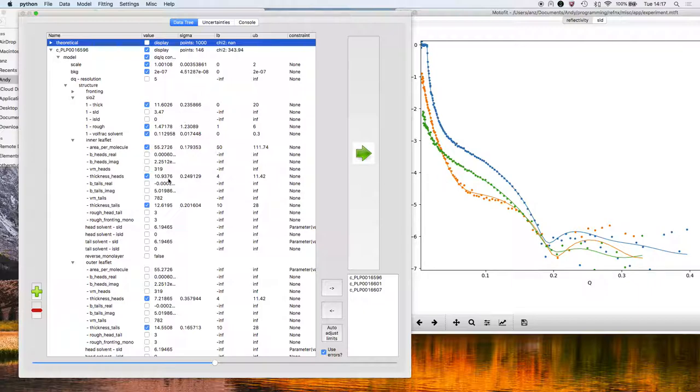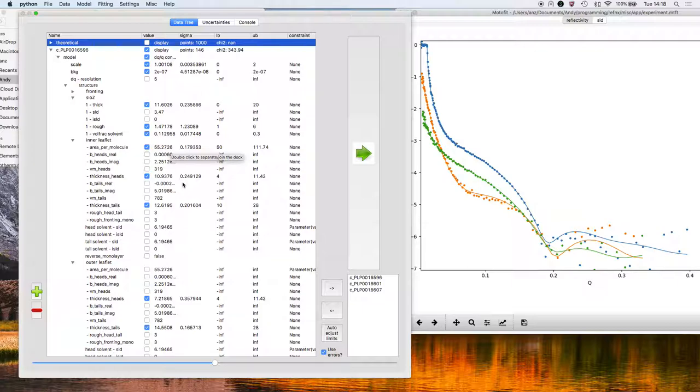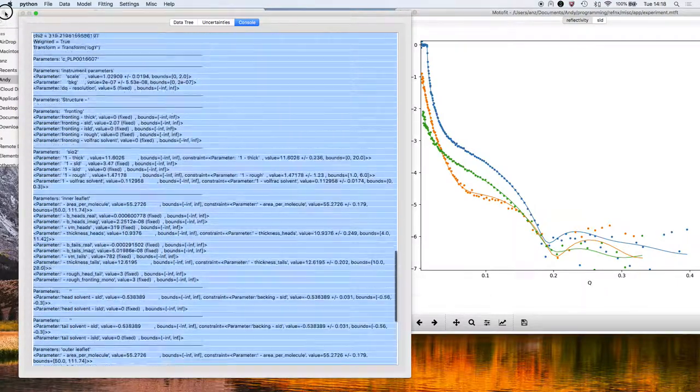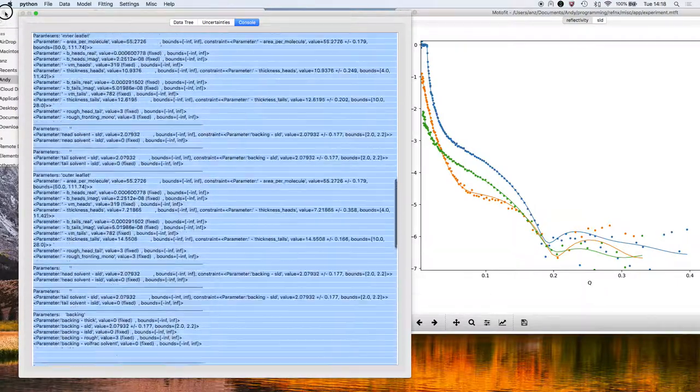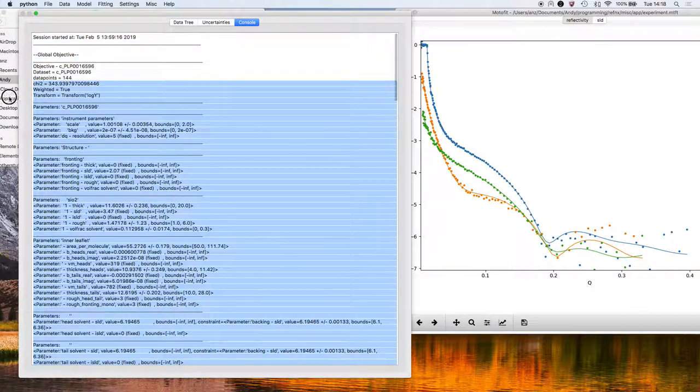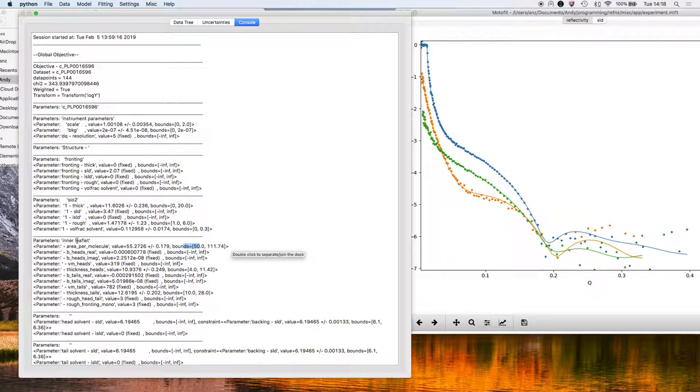The area per molecule for this lipid molecule is around 55 angstroms. In this column here, the sigma column, we get the parameter uncertainty, so the uncertainty in the area per molecule is 0.18 angstroms squared on top of that value, and so on. If we go to the console, you can also see the output of the parameter set for all the contrasts, so the inner leaflet parameters and uncertainties and what the bounds were. So you could copy that and paste it in a logbook or something along those lines.